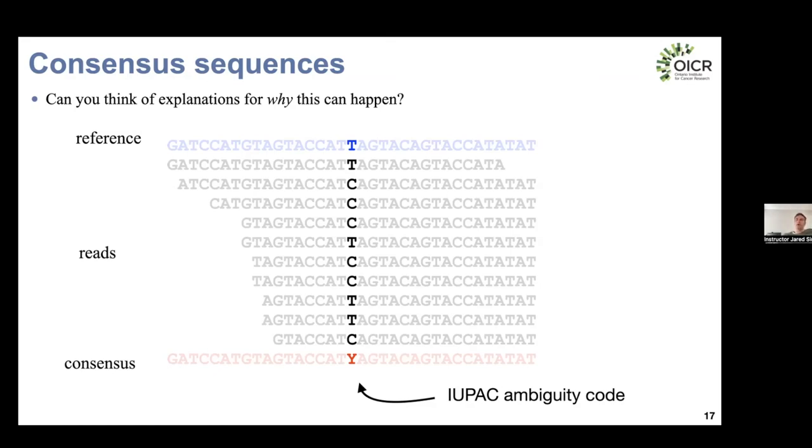Yeah, it's a great question. I'm not aware of any documented cases where, say, a lab tech was infected and that contaminated samples. The main route of contamination is the fact that we're using amplicon-based protocols. When the genome gets amplified, the amplicons go to incredibly high abundance, and they can contaminate lab equipment, like your thermocyclers and your sequencing instruments. There are cases where lab coats had amplicons contaminating them, and then it would end up in your sequencing run. Because there's such a high level of amplification, that was the main route for contamination.